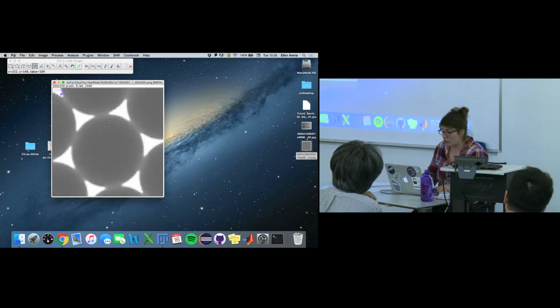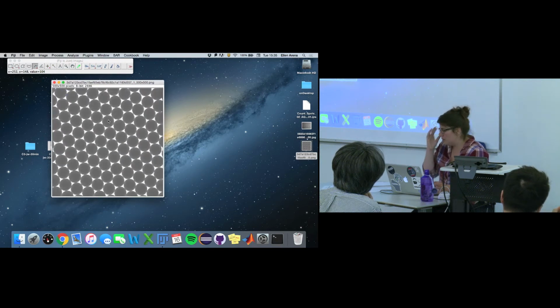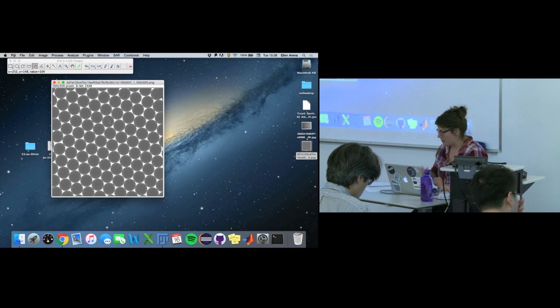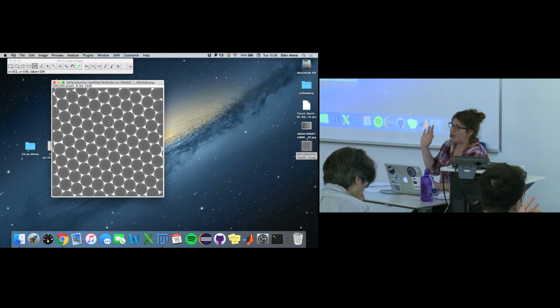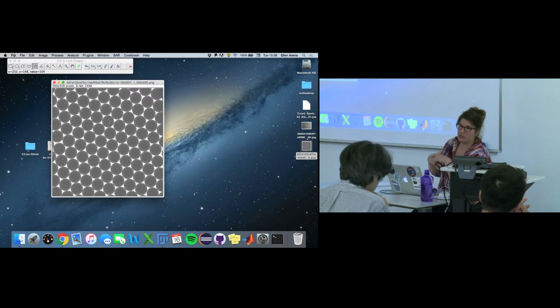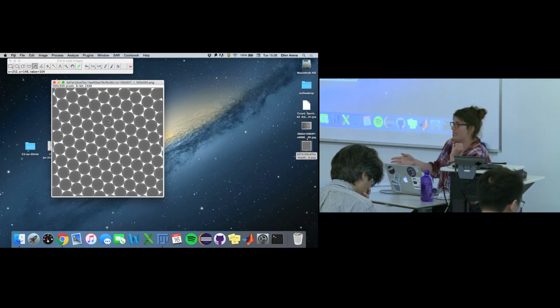But we can do a really quick, streamlined version of the segmentation protocol we just did to count these objects. Let's just do it again. This will help get that segmentation workflow ingrained in you. So the first thing, our contrast for these objects is pretty good, so we don't really have to do any pre-processing, like Gaussian blurs or median blurs. So we're going to go straight to the next step, which would be, what?